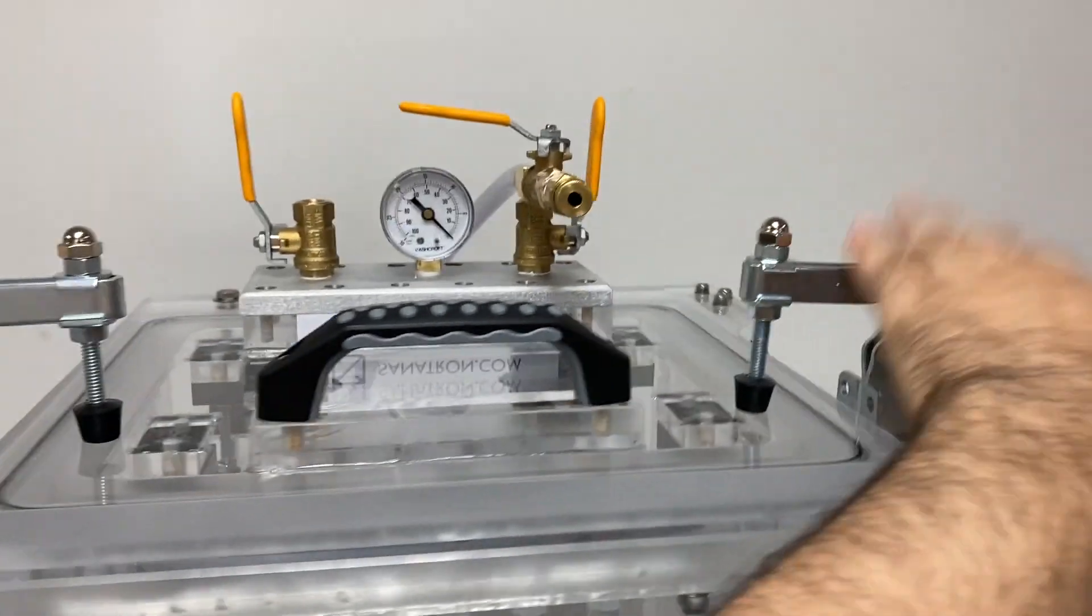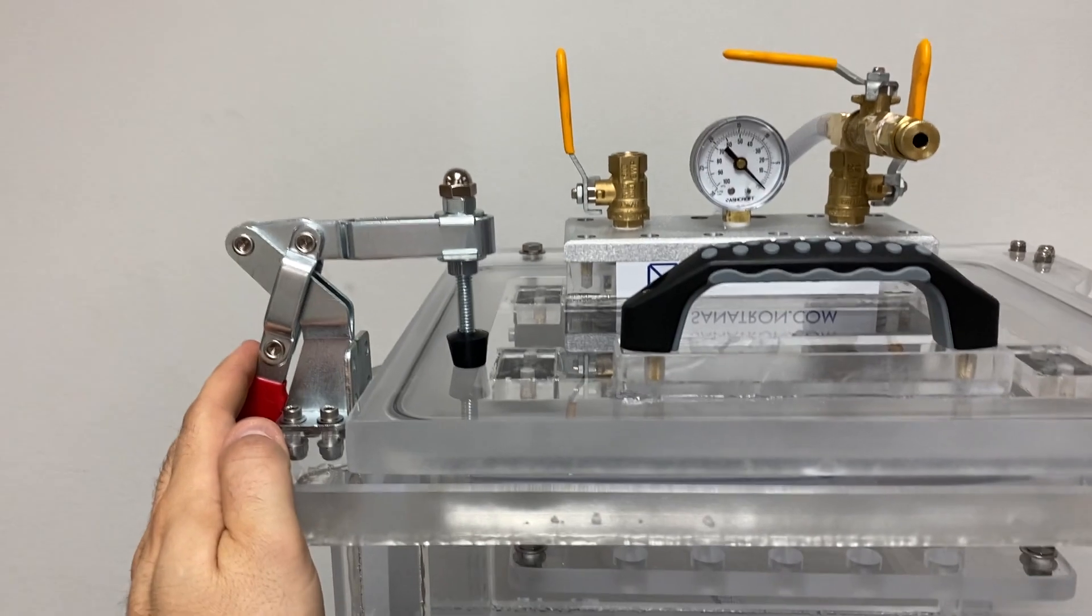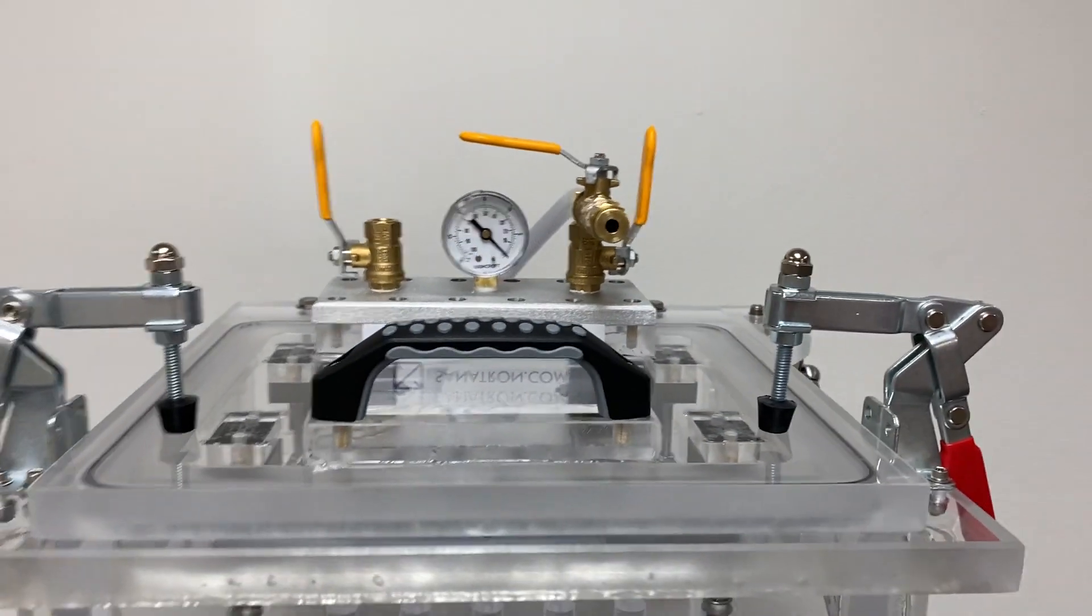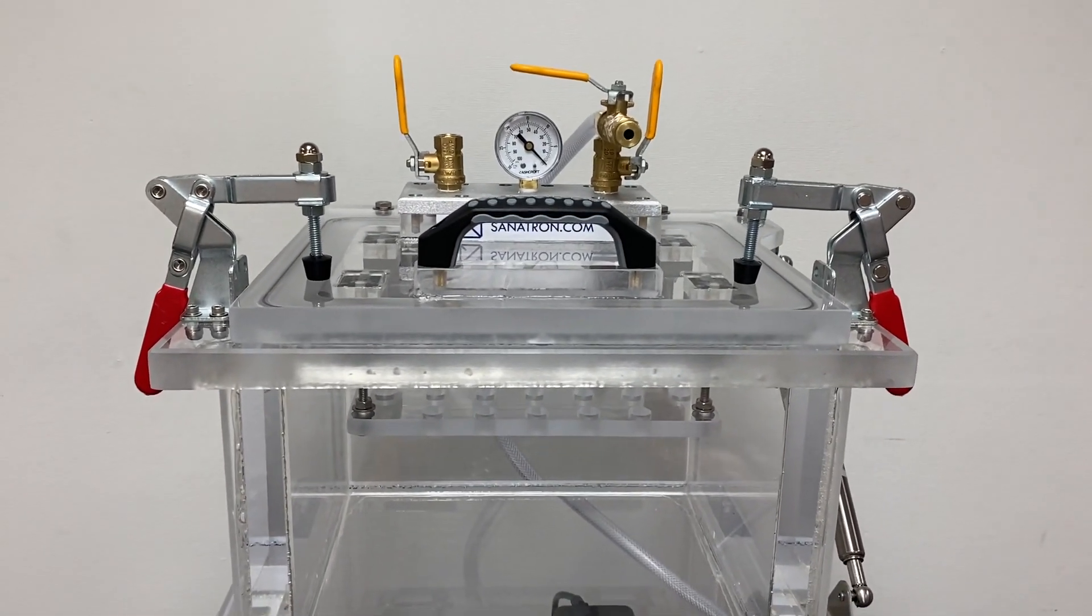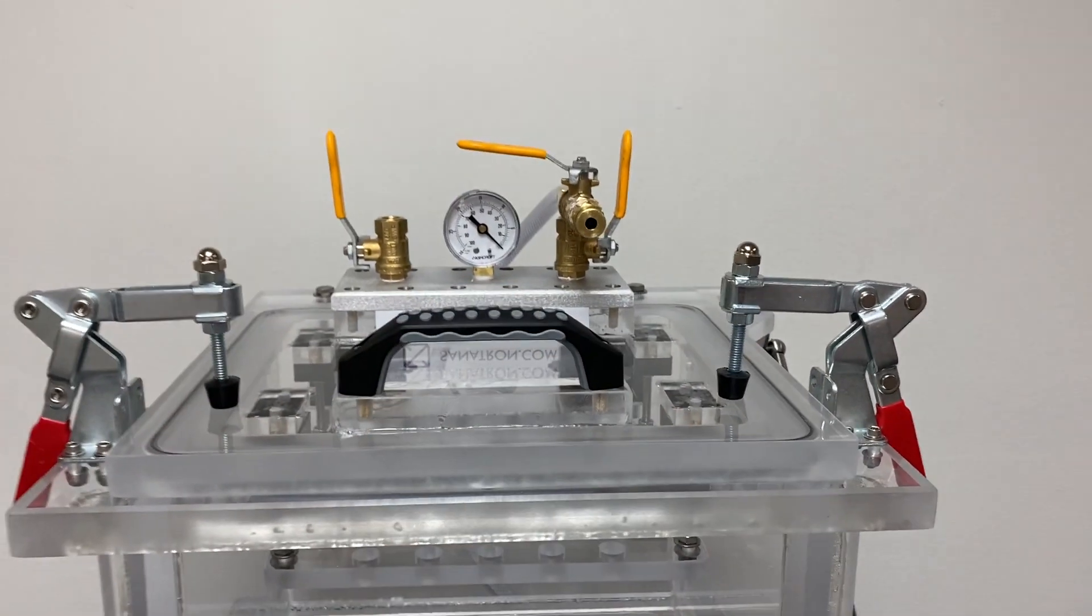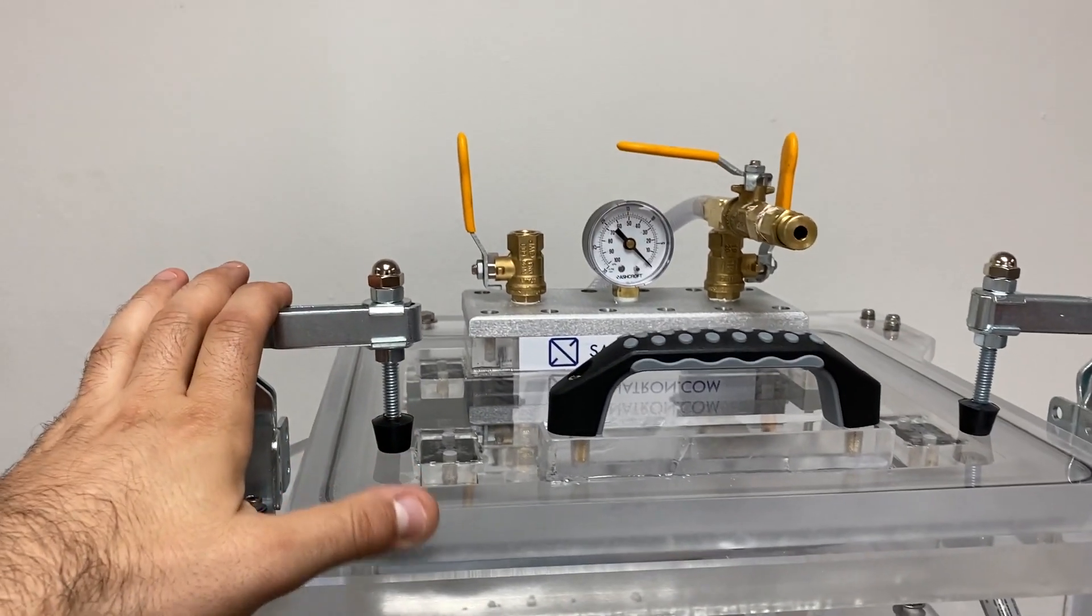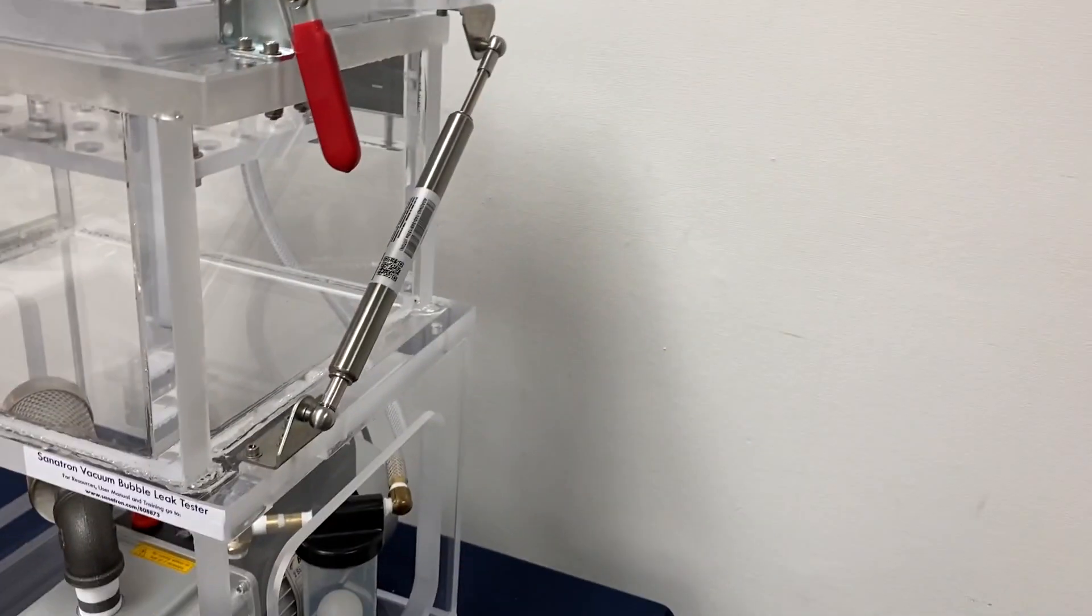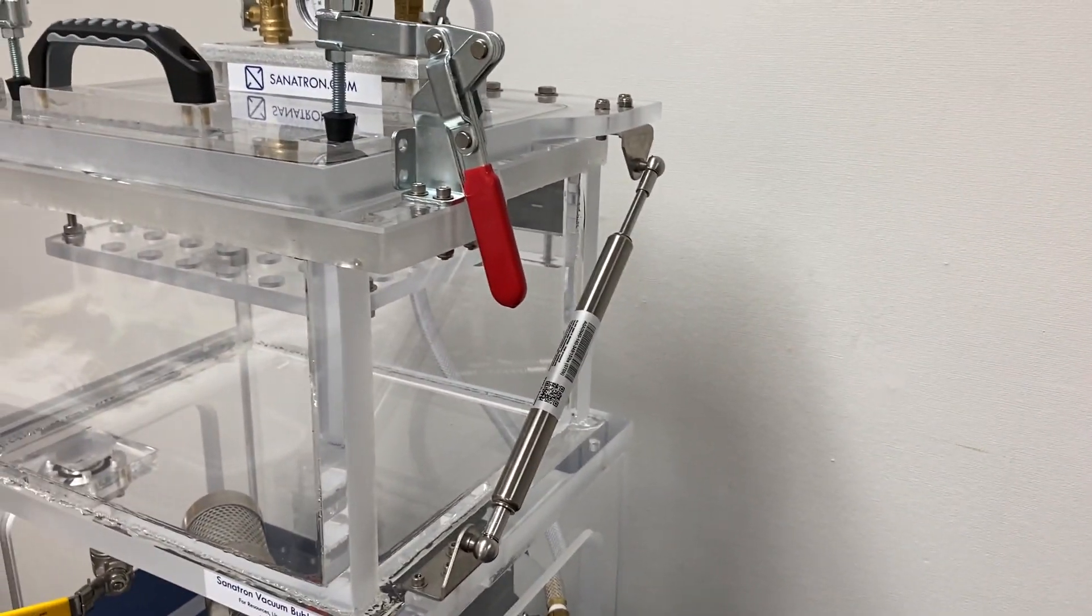This lid comes with two clamps. We like to have clamps so you don't have to be leaning onto the lid. You'll notice other bubble leak testers out there don't have these clamps, so you have to lean onto the lid and hold it to create vacuum. We didn't want to do that, so we're giving you two clamps, a handle, and on this side we have a gas spring that will keep the lid open so you can load your testing chamber with your test specimen.